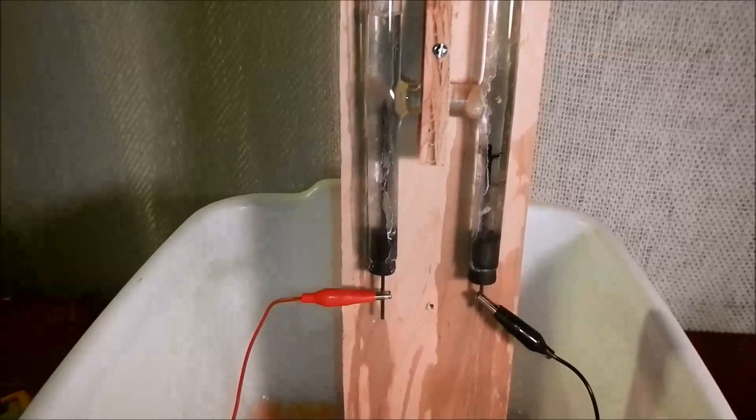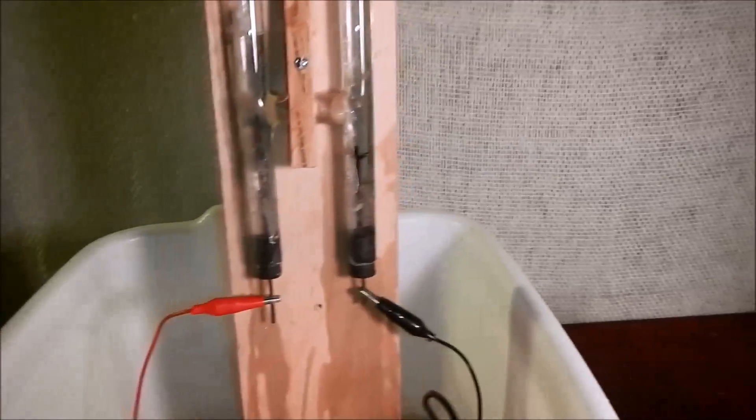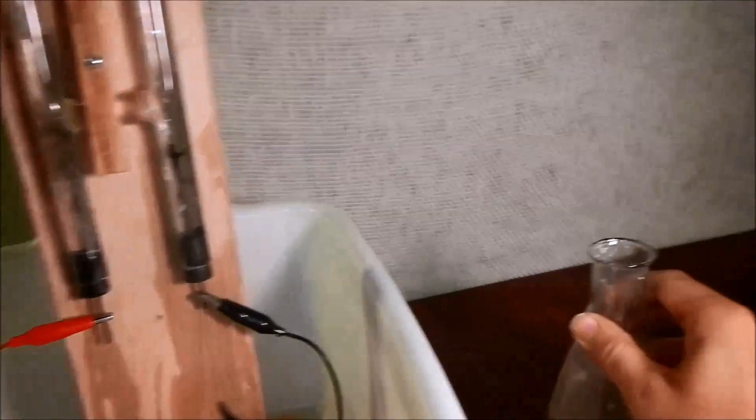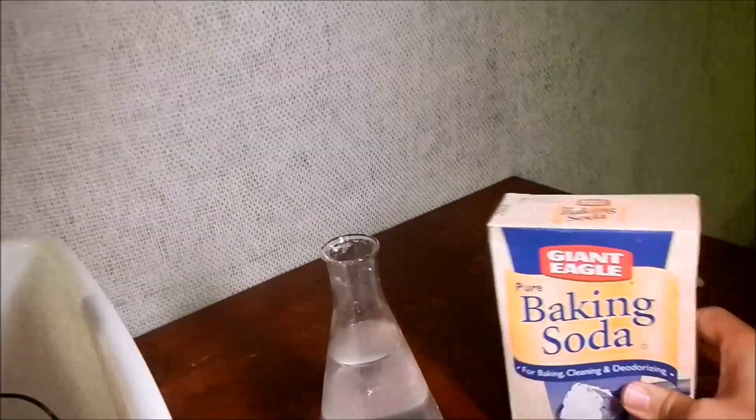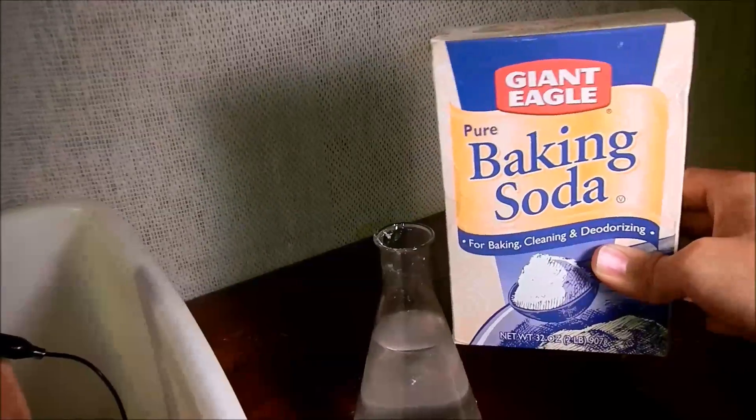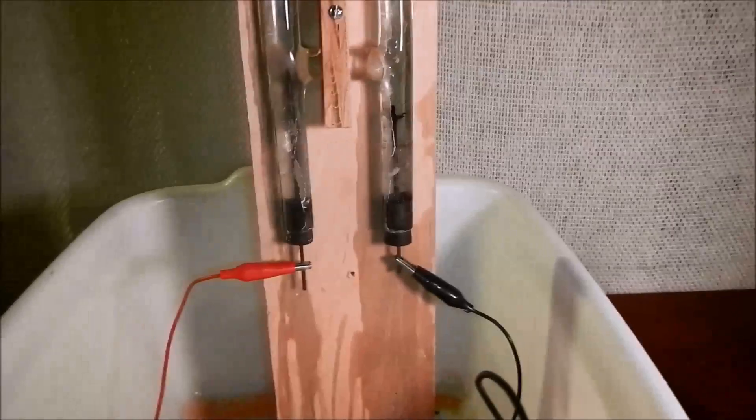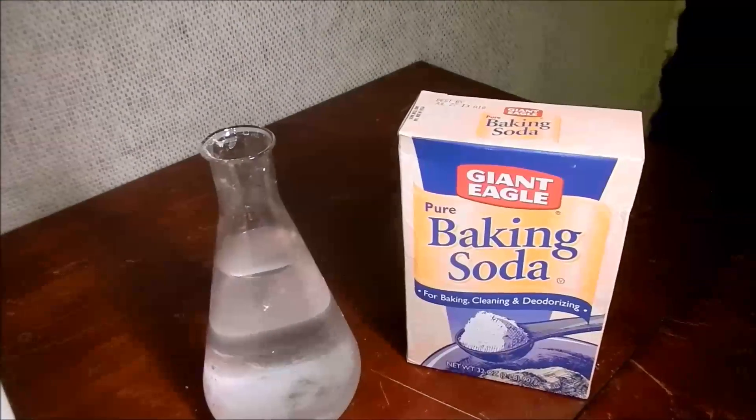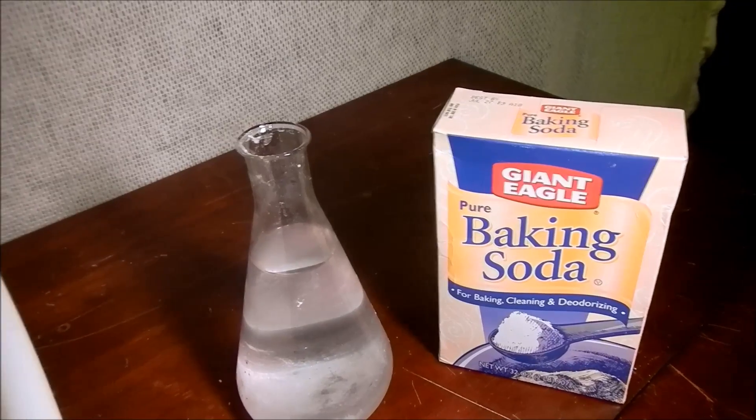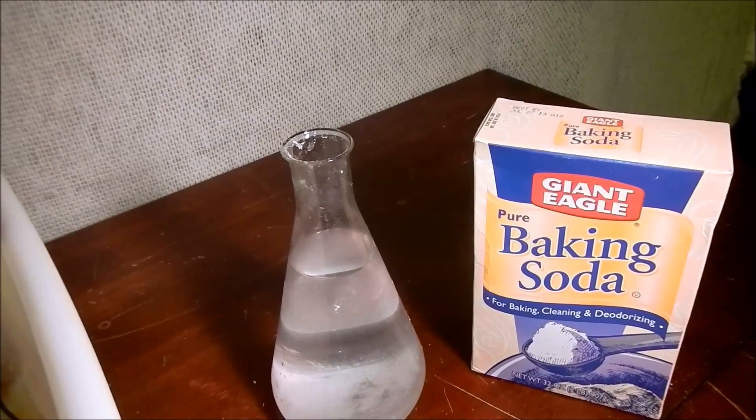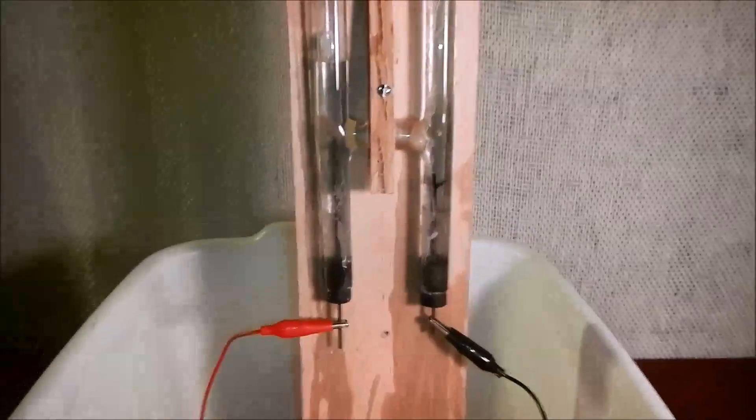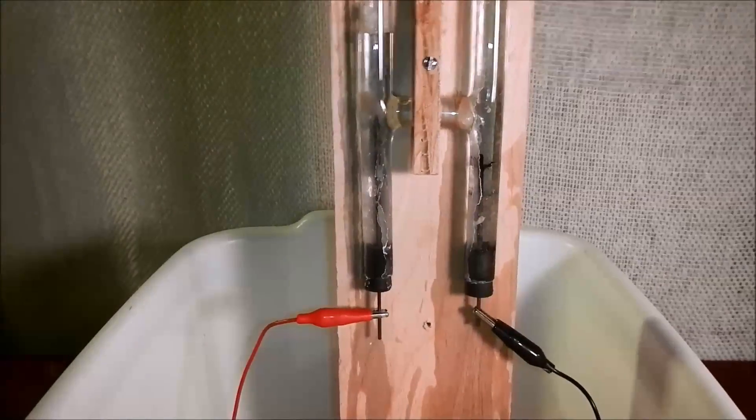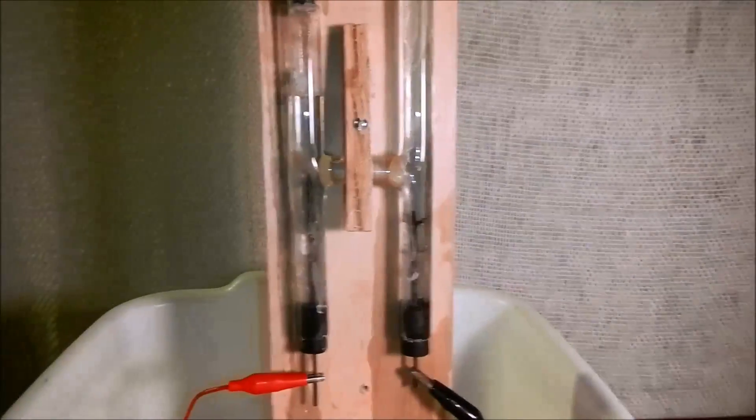And this has, as the electrolyte, water mixed with baking soda. I think baking soda is really great because it neutralizes both things that are very caustic and very acidic, so it keeps the pH of your electrolytic water pretty safe.